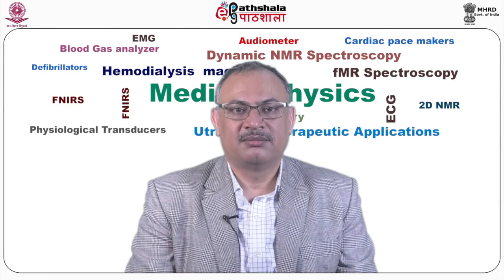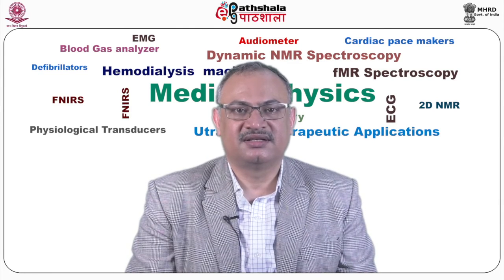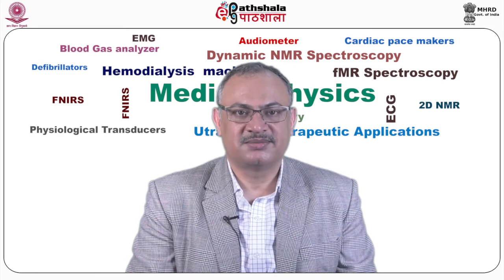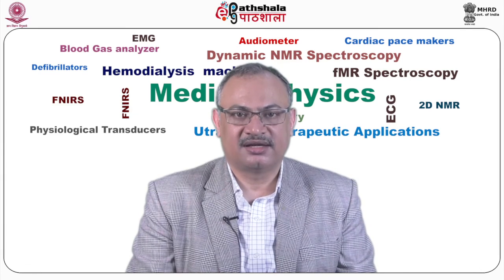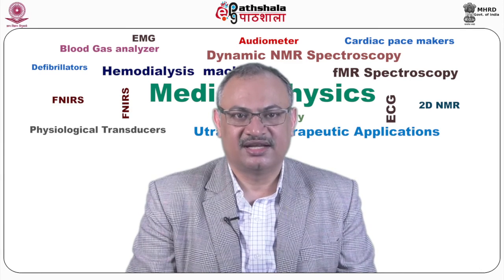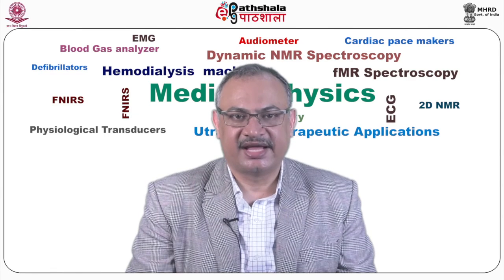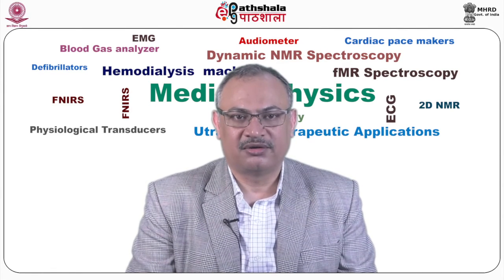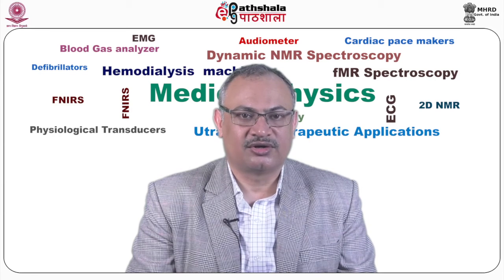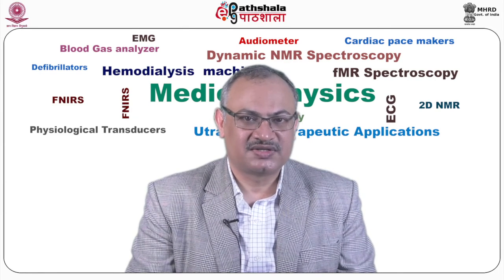This is followed by isotropic C13 mixing, and finally magnetization transfers back to the side chain hydrogen atoms for detection. Both the side chain protons and carbons are frequency labeled. This experiment helps to correlate the chemical shift information obtained from 3D HCCONH TOCSY and 3D (H)CCCONH TOCSY.